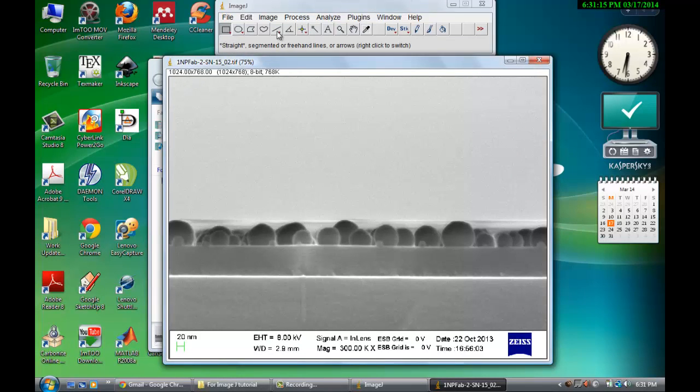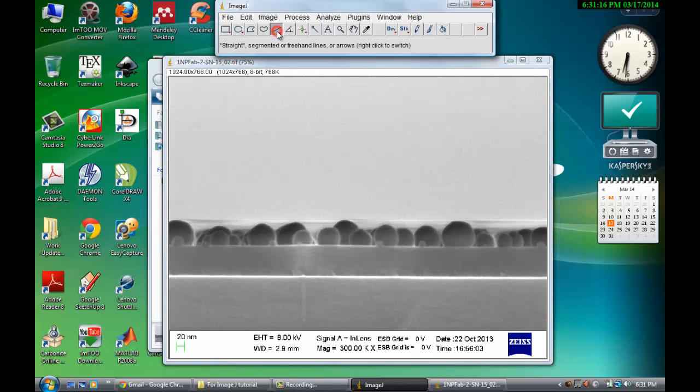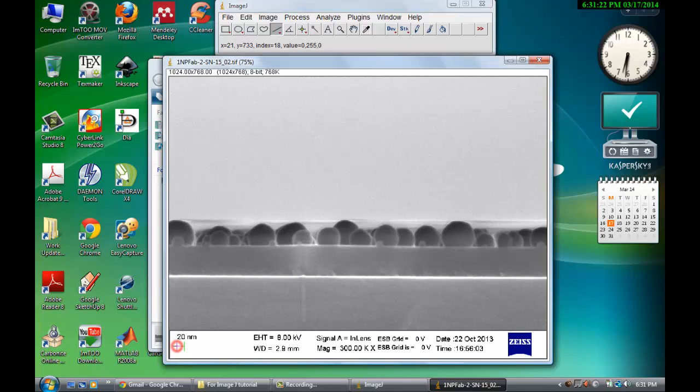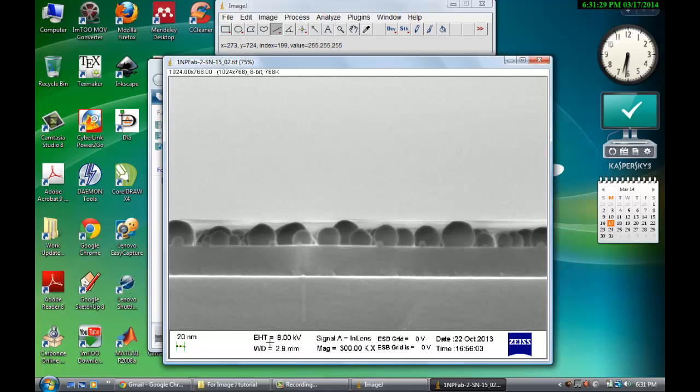Then click on this line scale which will allow you to calibrate your ImageJ scale. So select exactly the scale shown and drag it to exactly the same value. Now it is selected.